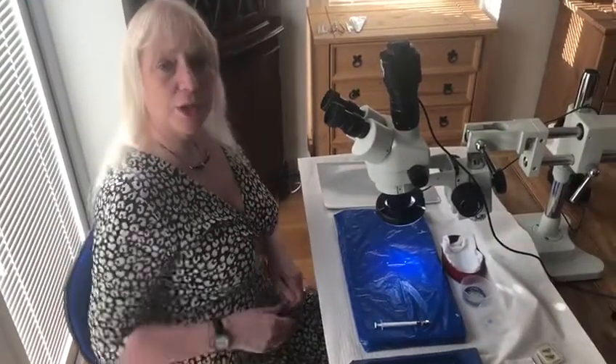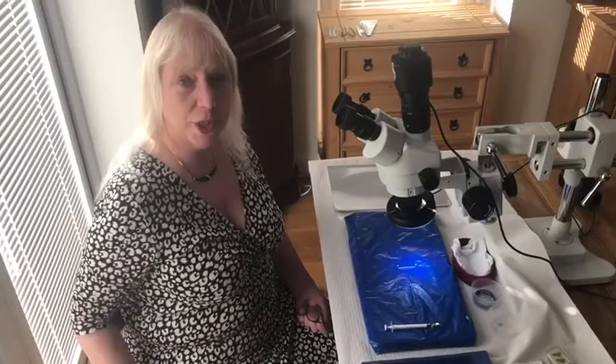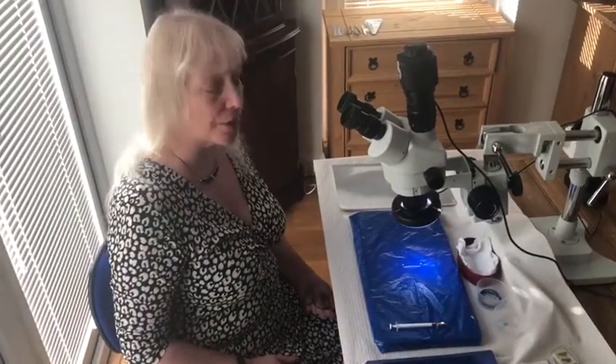First, you need a chair that you can adjust if possible — just a simple office chair will do — to make sure that you're at a comfortable height for your microscope.